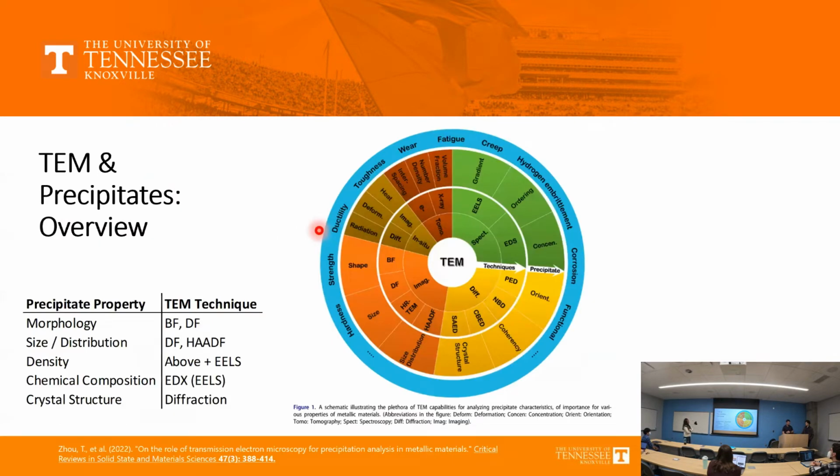So just a quick overview here. John and I think we both agree that this project has really just illuminated to us how much there is that we don't know about in the field of TEM with regards to precipitate characterization. You can see here in this graphic, this is kind of broken off, starting from the inside, working out. You can think about different techniques, primarily belonging to imaging techniques, diffraction techniques, or spectroscopy techniques. And then there's also some specialized in situ TEM and tomography for three-dimensional reconstruction that we're not going to focus on as much today.